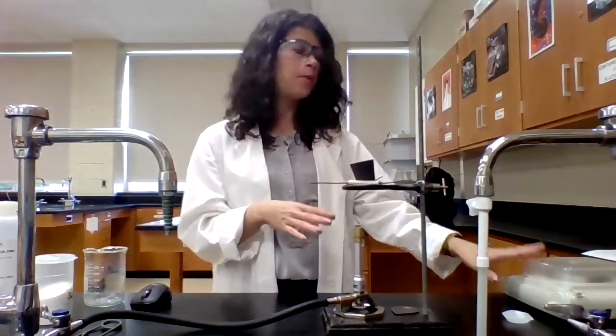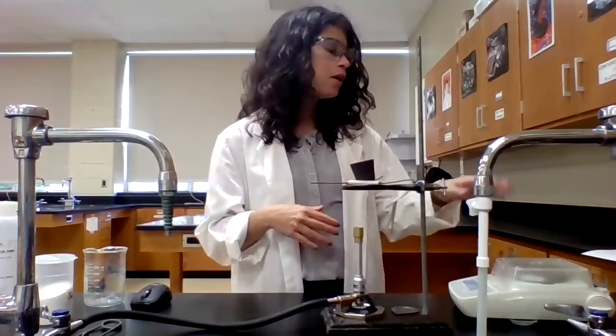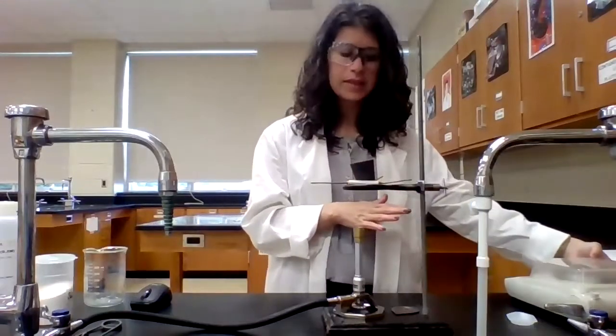And then in addition, the balance that I'm going to be using when I need to weigh the crucible is an analytical balance. You can see our analytical balances have a lid here because they're very sensitive. Even airflow in the room can cause the mass to fluctuate. An analytical balance will record the mass to 3 decimal points, so I'll be able to record the mass to the nearest milligram. Again, I need that precise data. So that's why I'm using our analytical balances.